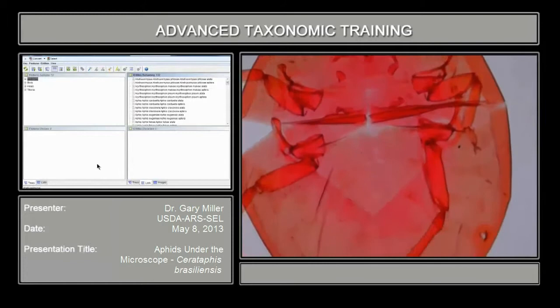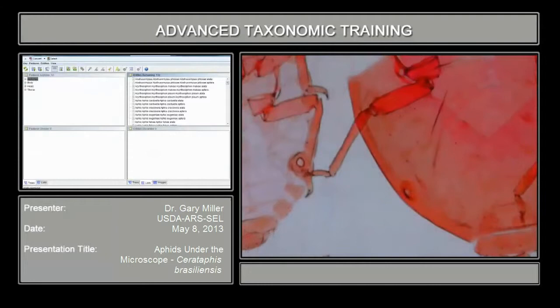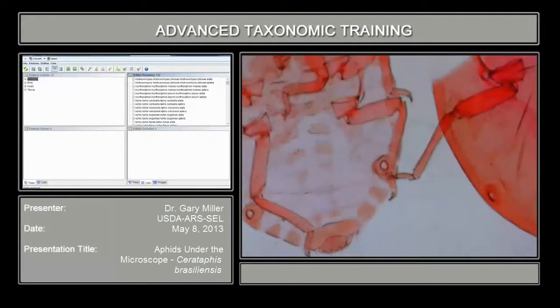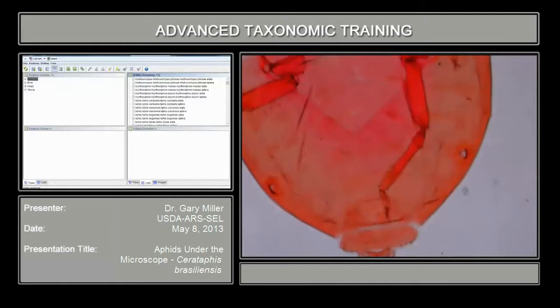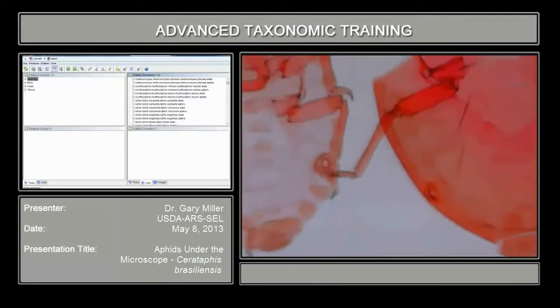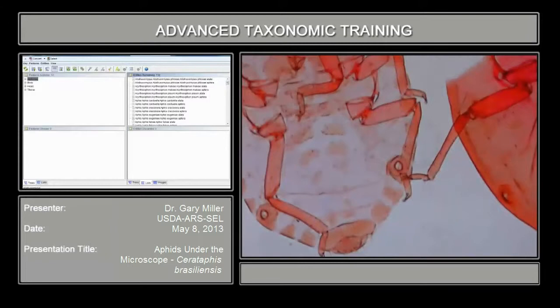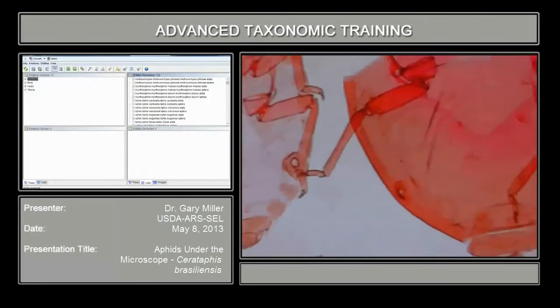This particular specimen is an adult, and I think it has a nice example of an immature beside it. You can see the presence and absence of that genital plate — that's the subgenital plate here. There is an anal plate, but not a subgenital plate showing on the immature.